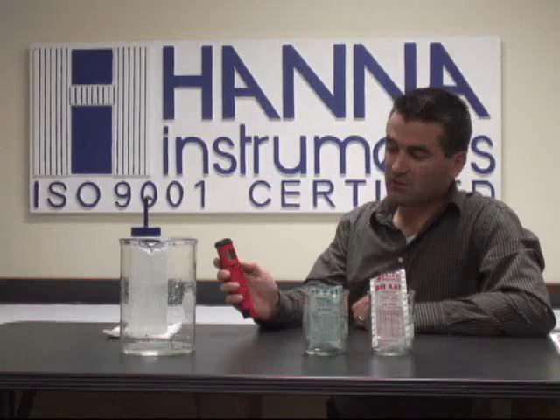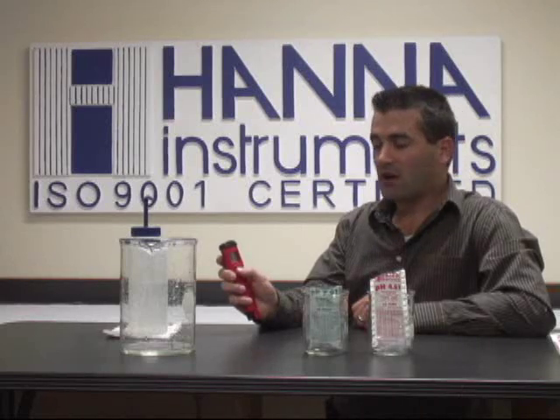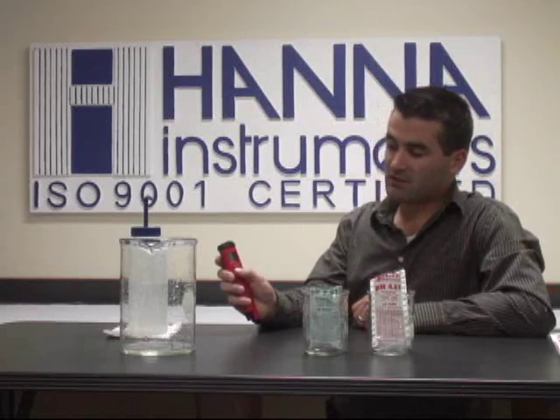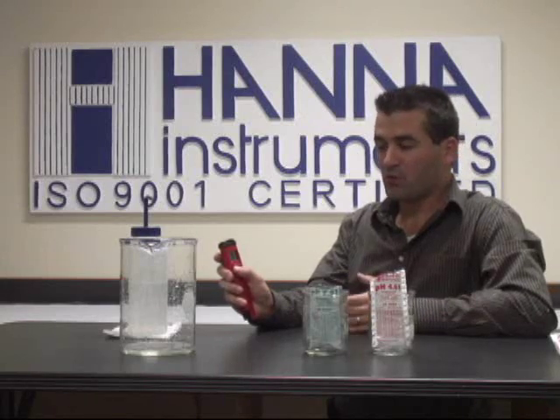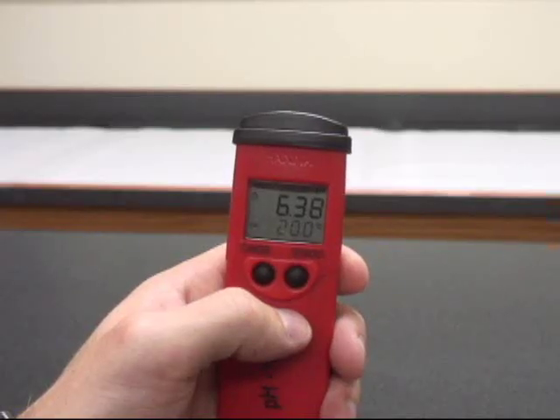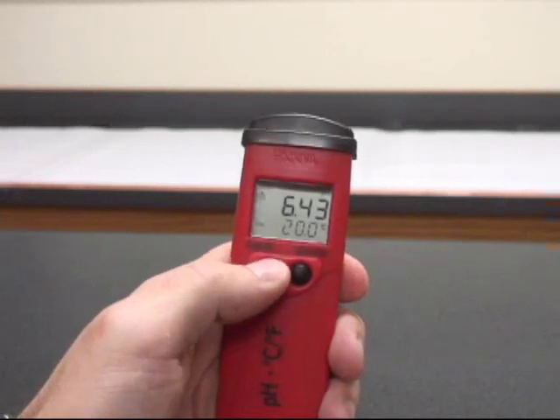It doesn't take too long as you can see. What we're going to do to go into calibration mode is hold that mode button down until we see it go through off into CAL or calibration mode, and then let go of the button.